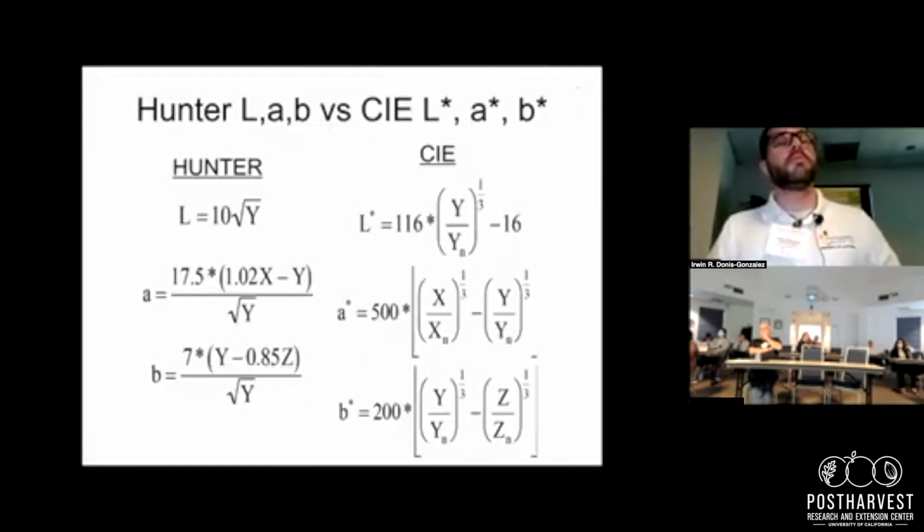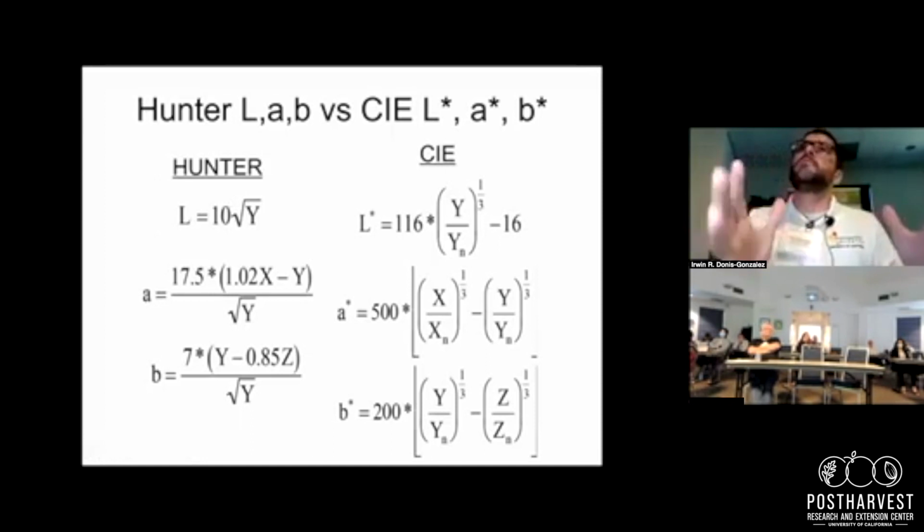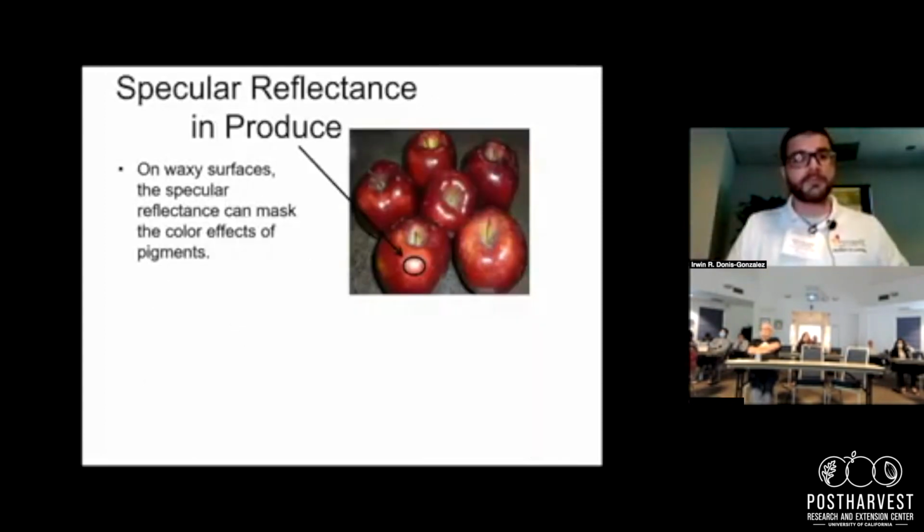And when we explain color, there are different notations of color. In this case, I'm just showing the relationship. You don't need to memorize these formulas. You can access them later. I'm showing a relationship between what I talked about in the X, Y, Z, two different measurements of color. Basically, what they did is they're just trying to offer that crispness, so that our human eye can differentiate between one color and the other.